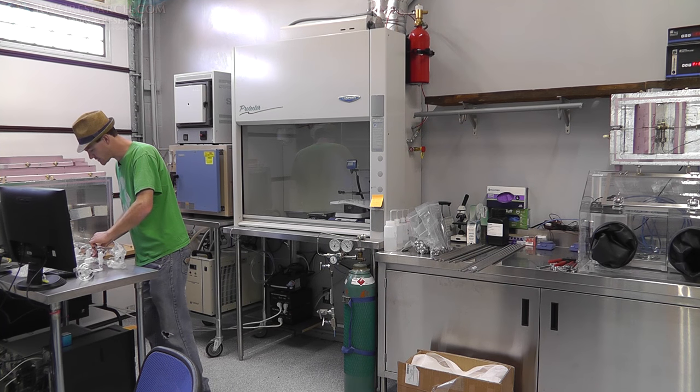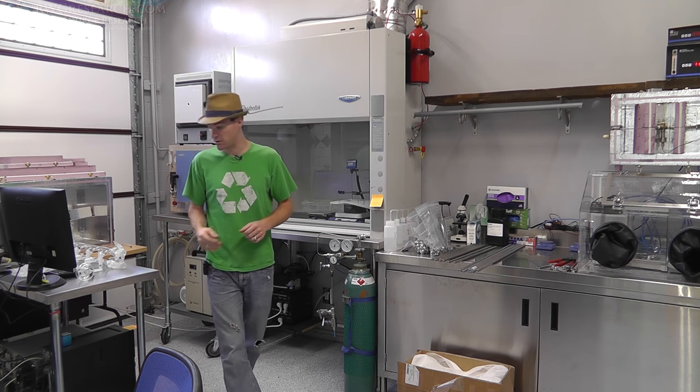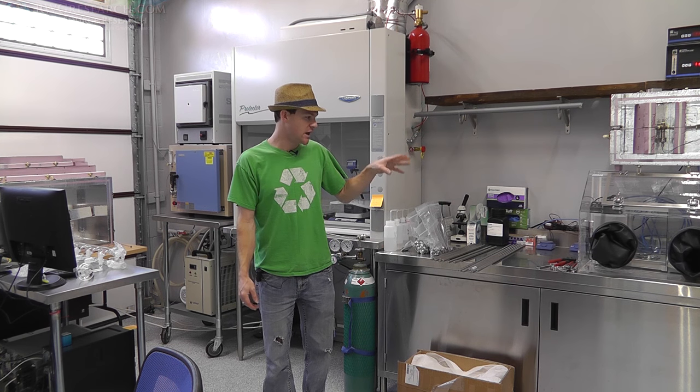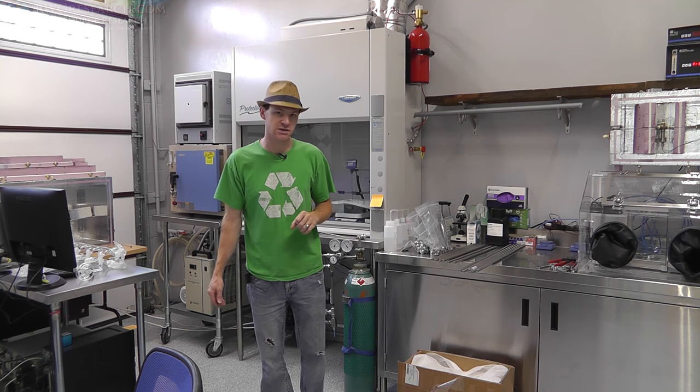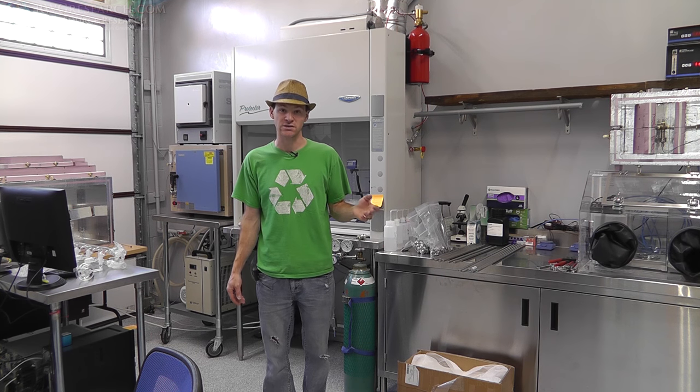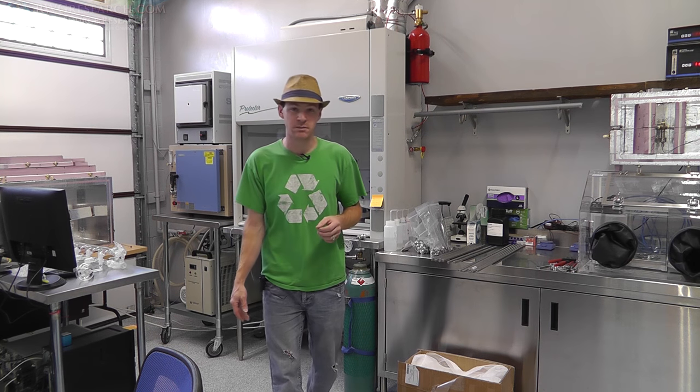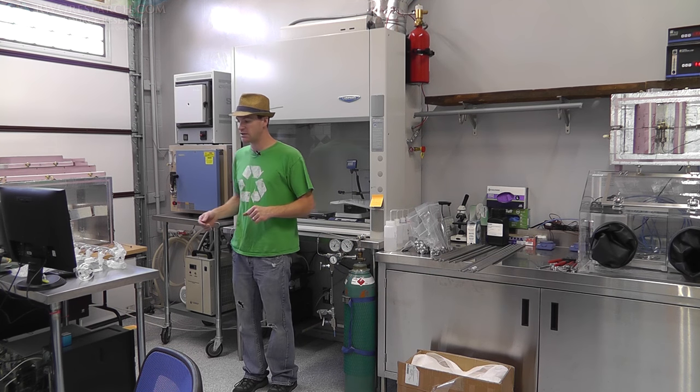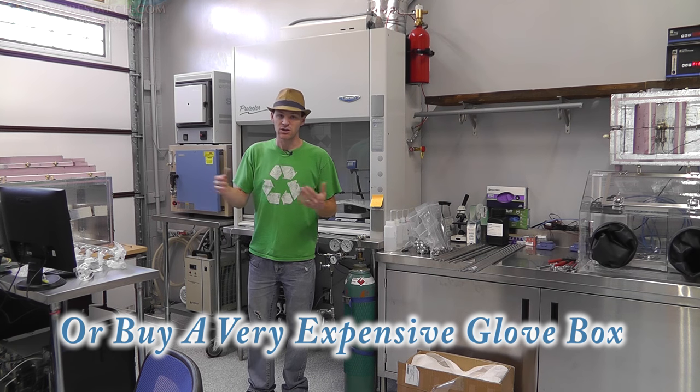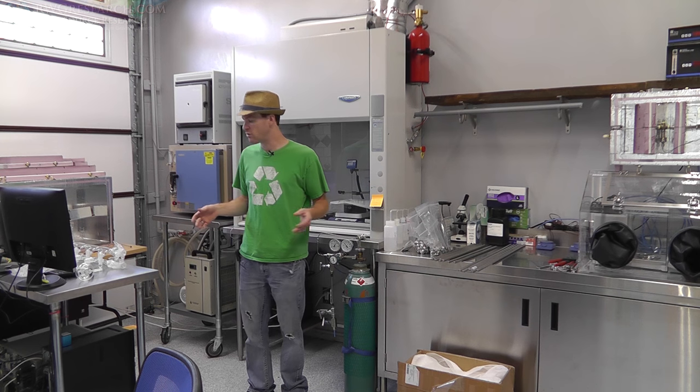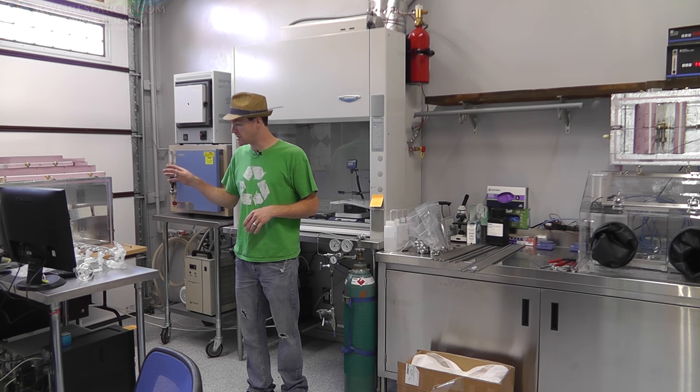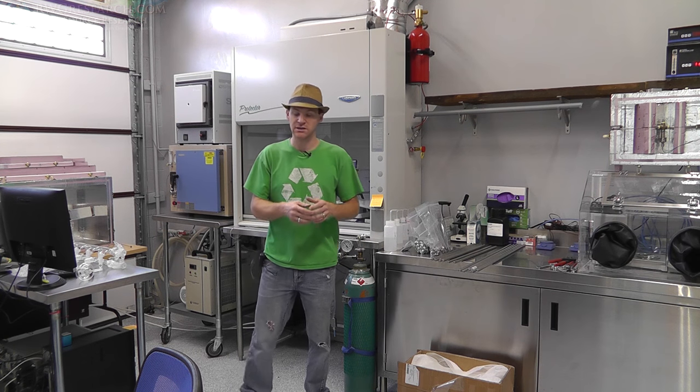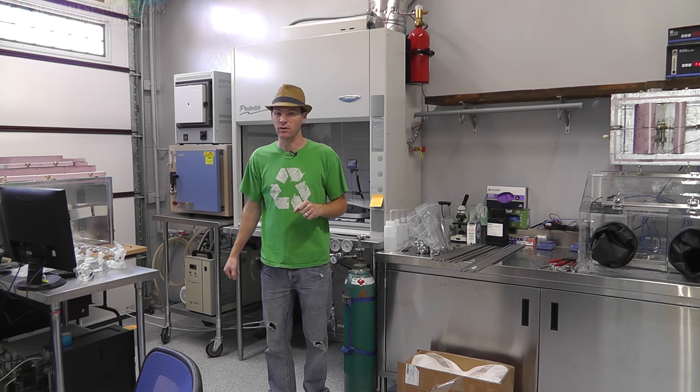I briefly want to run you through a few things that we've tried around here and then the reason we're going to a Schlenk line. We have this glove box you see right here. This glove box is not the best glove box for super high inert conditions and really clean atmospheres as far as low oxygen content. We want to be way down into the PPM range. So, the only way to really get around that is to build a Schlenk line.